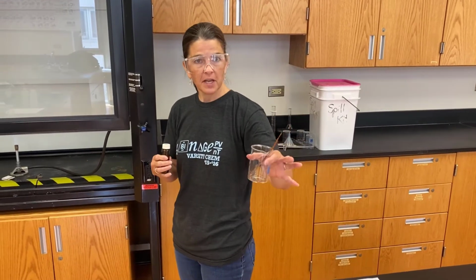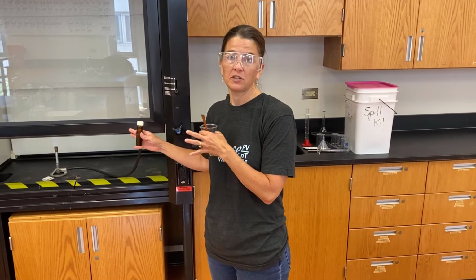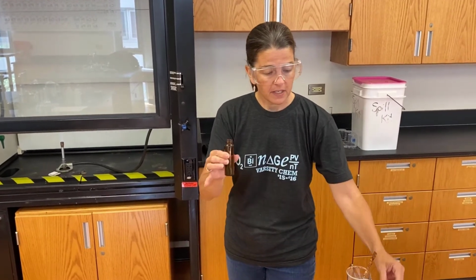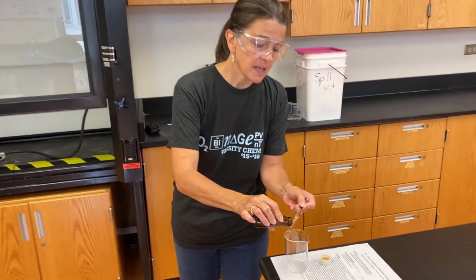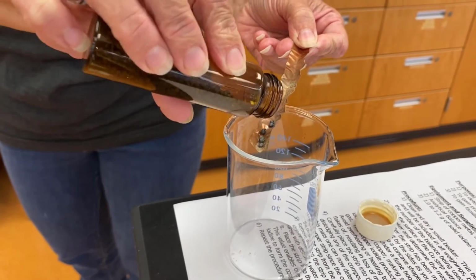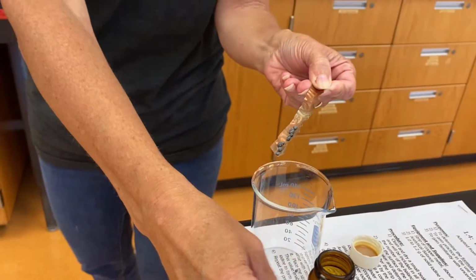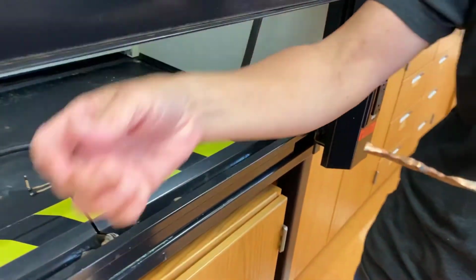So we're going to pretend we've massed this already. And now I'm going to go to my fume hood because I don't want to inhale iodine vapors, and I'm going to do the rest of this in my fume hood. This is my solid iodine. I'm going to put a little bit of it on the end of my copper. That should be plenty. Okay. I'm going to come over here. Turn on my fume hood.